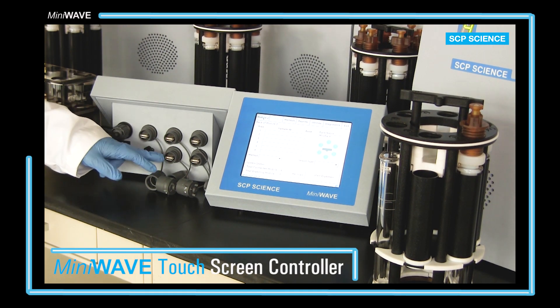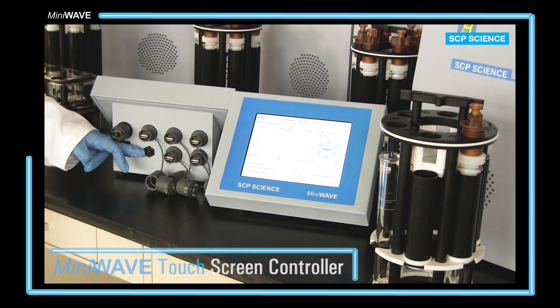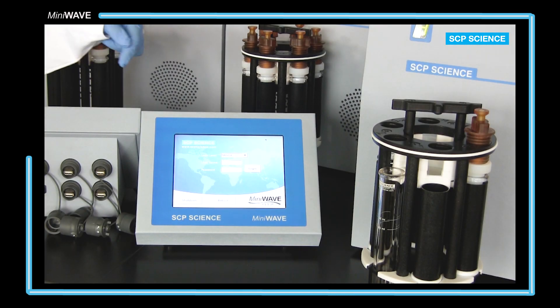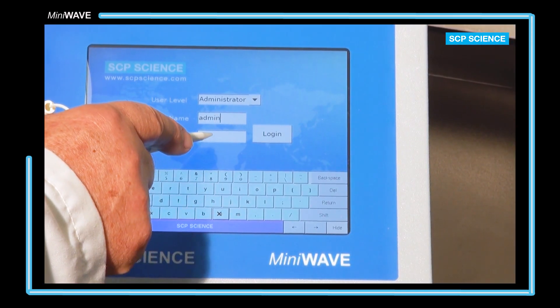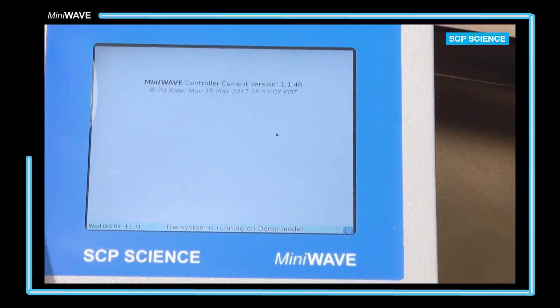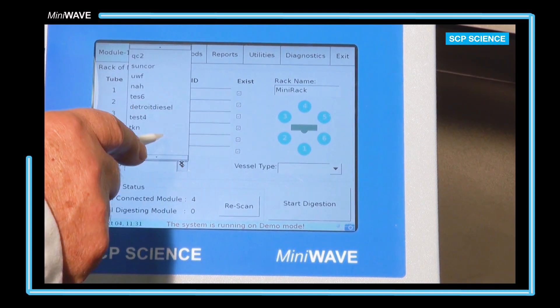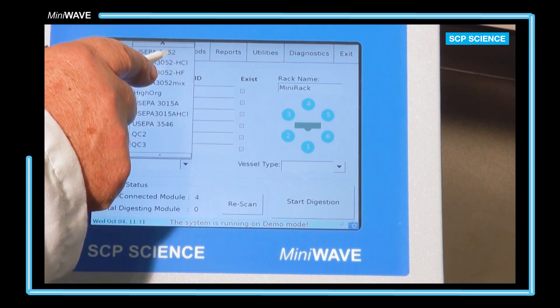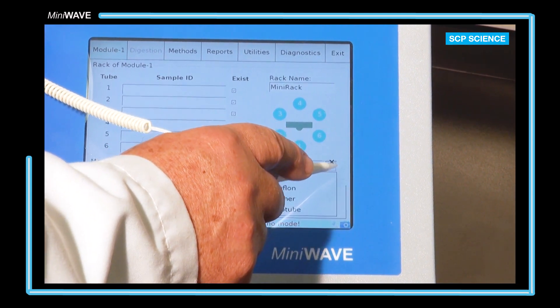Four USB ports are used to connect up to four MiniWave modules, with the fifth port for reports. On the touchscreen controller, the user would enter their username and password and then click the module tab. The method is selected as well as the type of vessel. The method selected here is US EPA Method 3052, mineral analysis of a wastewater sample.